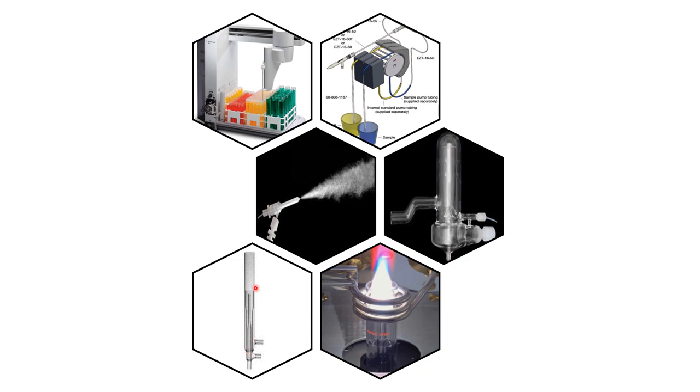And this is the glass tube, often referred to as a torch, that the plasma exists in. On the outside, it's a number of tubes inside each other. On the outside tube, we pass a very high flow of gas, because we don't want this plasma, which is at 6,000 Kelvin, to touch the sides of the glass, because it would instantly melt. Then through the middle tube, we pass a flow of argon gas that is slightly slower and hangs around long enough to be ionized and form this plasma. And then in the very central tube, we pass this spray of our sample.